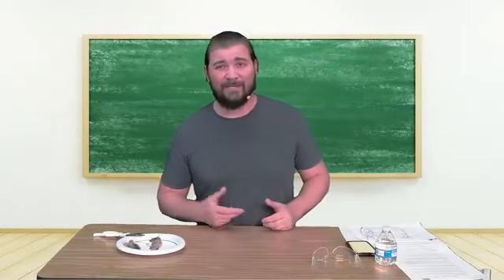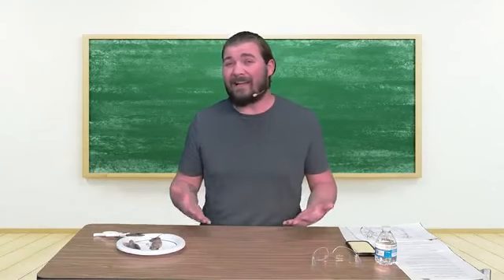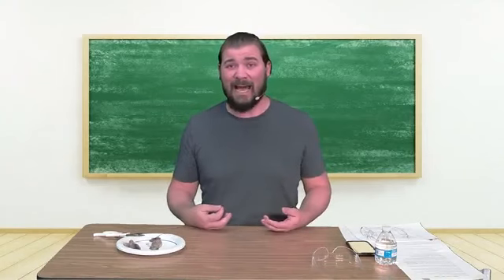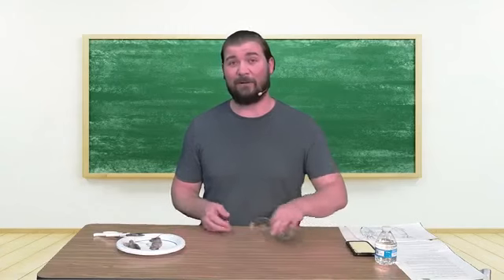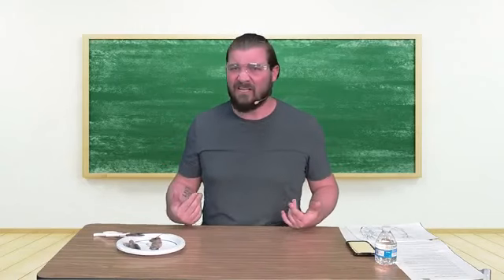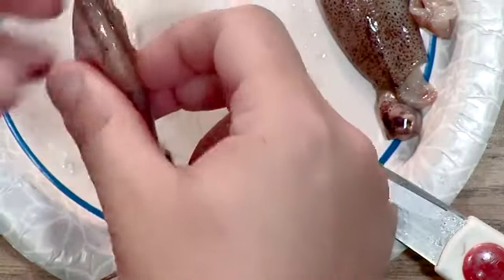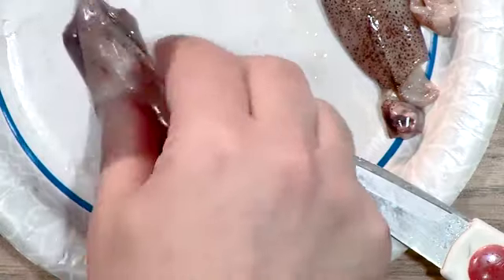All right, so now it's time to look inside the squid. And probably is not going to happen, but just in case, I don't want anything to fly and hit me in the eye or something and I lose my contact. That makes a whole different video, although it does sound pretty funny. I don't wish that on anyone. So I've got my science specs here. I'm going to put those on just for some protection. It's a great idea. And let's dive right into this guy. Sorry for the ocean pun there with diving in, but you know, that's what you got to do sometimes.